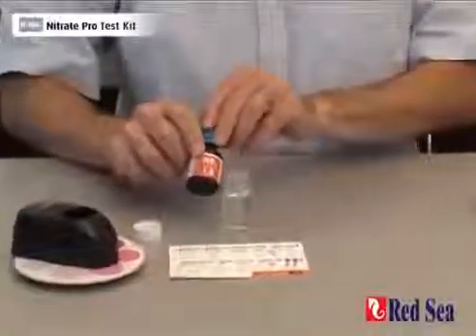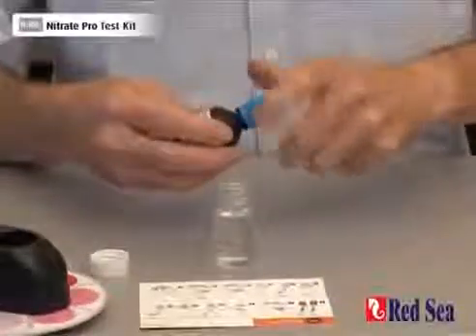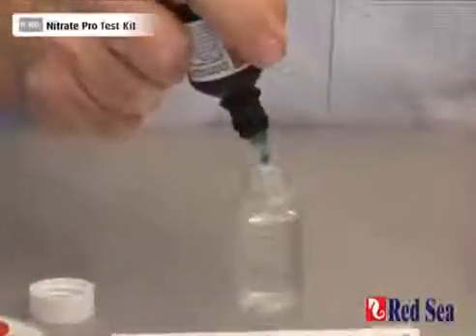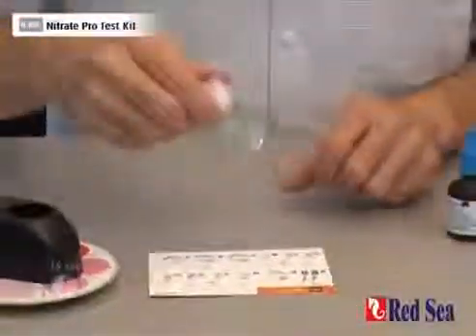Lastly, we add another five drops of Reagent C. And again, we shake for 15 seconds.